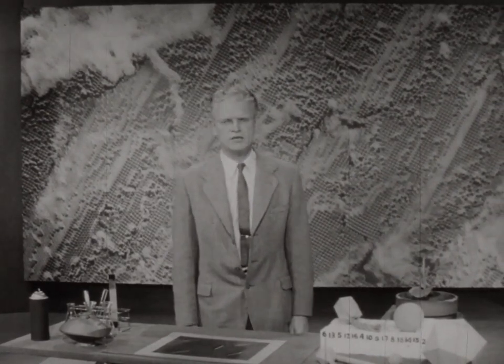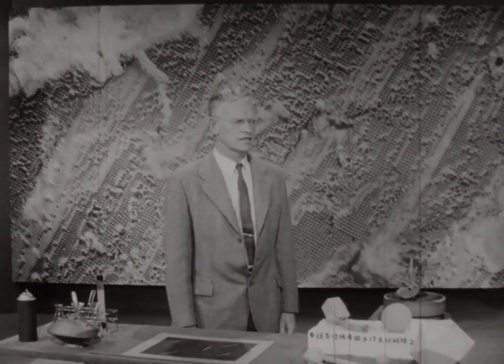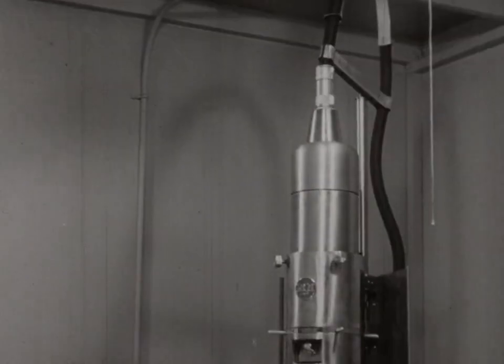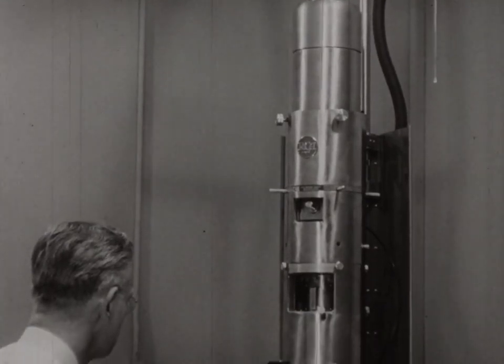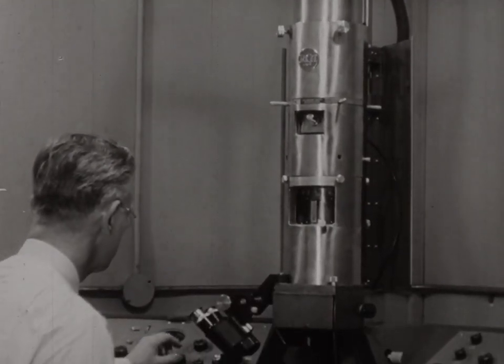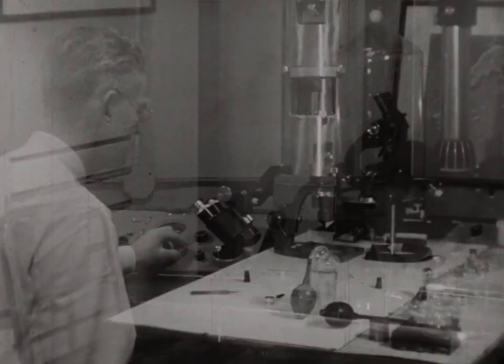We can also take a straight look at these particles. And to do this, we use the electron microscope. The electron microscope uses electrons instead of light, and instead of using glass lenses for focusing light, it uses magnets in order to focus the electrons. It is rather a large instrument, and it is necessary to have a vacuum in the instrument while the electrons go through.